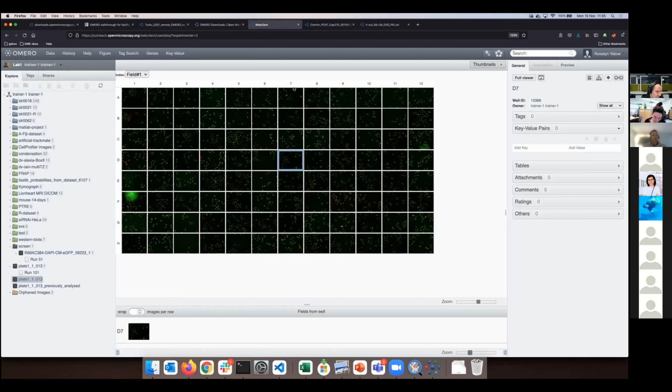So I set it up kind of generously, meaning that you have your own image as well as my image to view. I could have set it up also non-generously, and you would have only my image to view, and every one of us would be viewing the same image. This is not so. I did it generously in order to teach you that you can have your image as well as your colleague's image, and you can view both and work with both. I need to give you a bigger portfolio where I have your image for yourself and somebody else's image for myself.